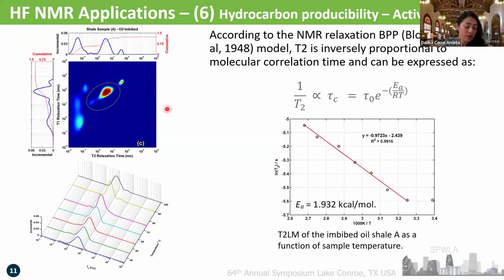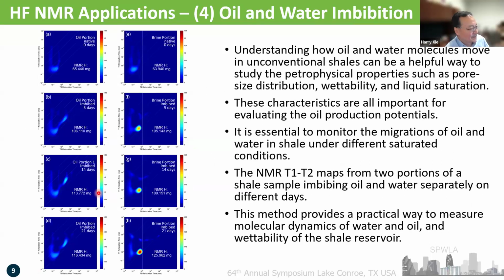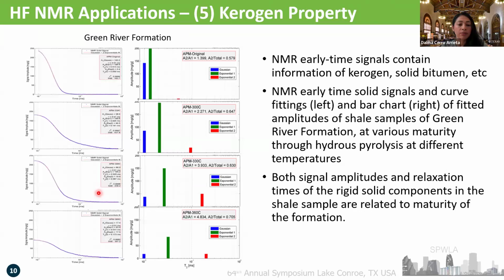I had a question, but I think it was Sabia's, the first question. So this inversion that you did was from the raw data, right? Like fitting the Gaussian and exponential functions to do the inversion for the raw data, for identifying fluids after the inversion, right? You're talking about these maps, the previous one, yeah. Okay.